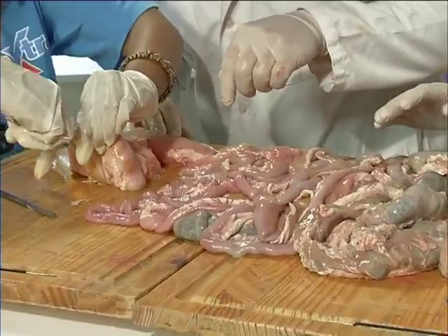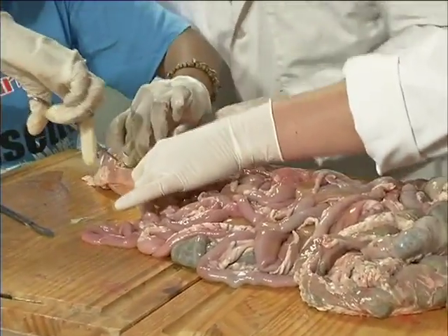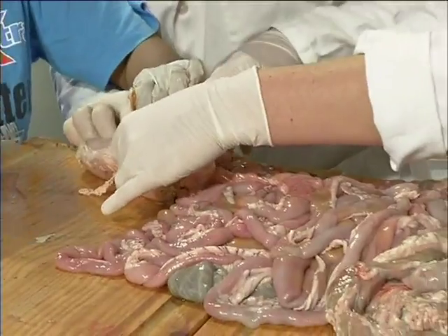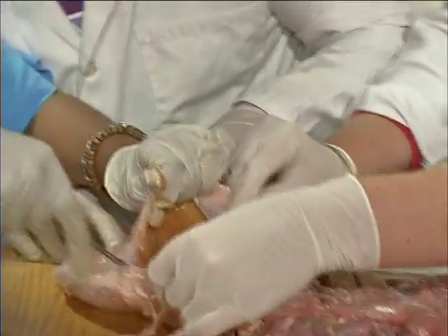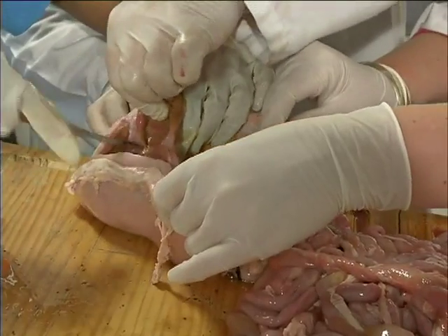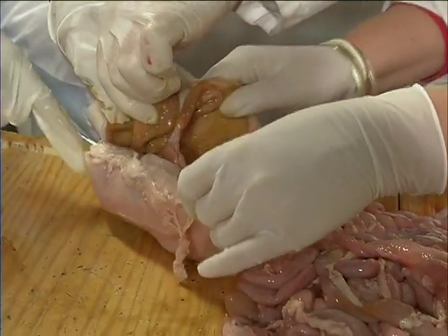How are you doing there? Let me hold that side. We'll make a surgeon over here. Come on, you've always wanted to grab the knife. If you think the knife is going to be better, the scalpel. Careful, I can see the blade. Cut straight through, all the way. We've got a butcher in the making! I'm so excited.